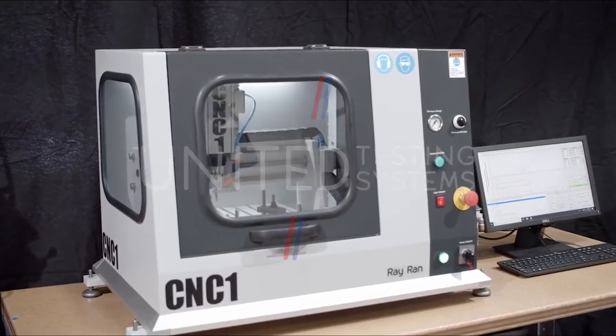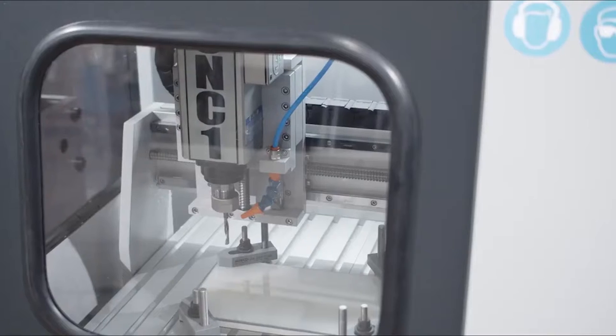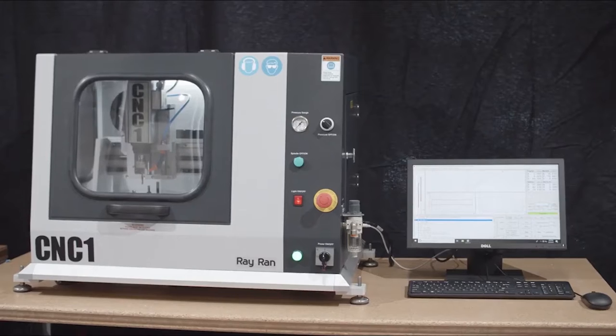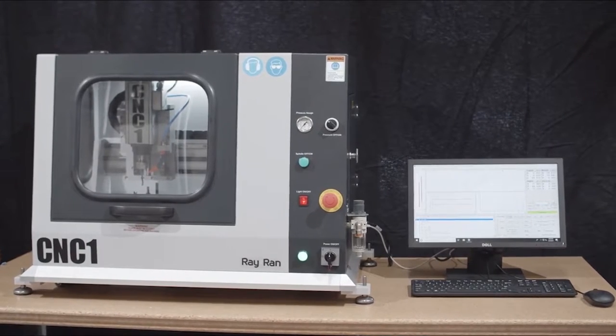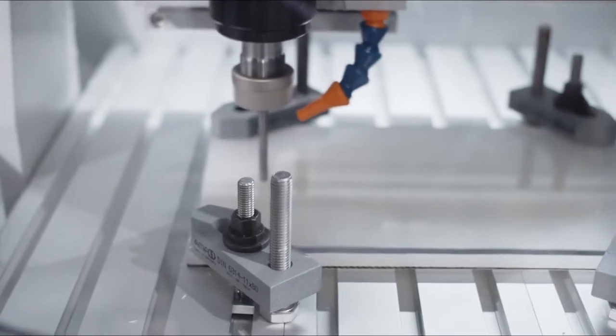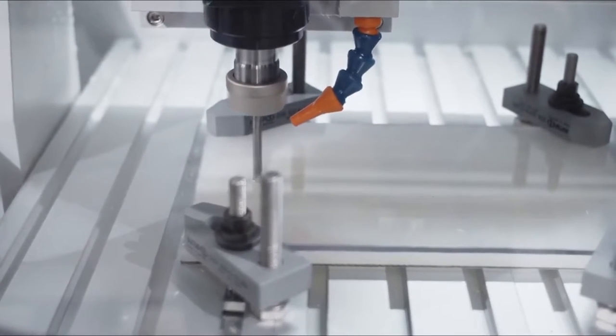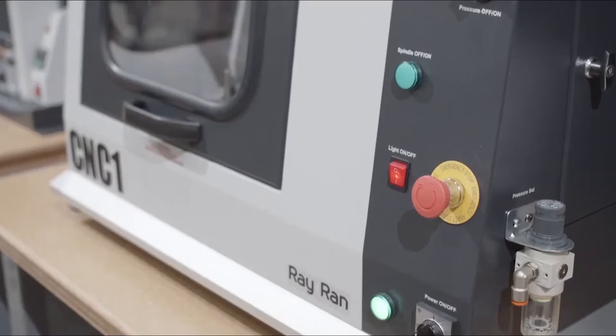Proper test sample preparation is critical for accurate and repeatable materials testing applications, and United Testing Systems is pleased to offer our customers a complete line of sample preparation products manufactured by our sister company, Rayran.